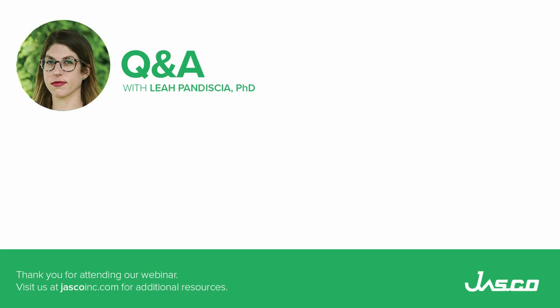What bandwidth for the 300 nanometer for HD voltage? I think it's 1 nanometer. Can I take a video doing the demountable cuvette? I can definitely do that. I will have to remind myself to do it tomorrow. But yeah, I can do that and post a video somewhere.